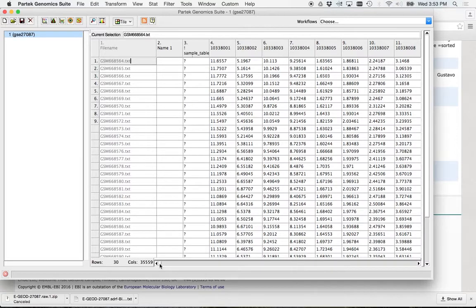You can see, as you get down here, we've got 30 samples, and we're probing approximately 36,000 genes. Is everybody with me so far? This is simple, isn't it? Everybody's looking at me like it's going to get harder. No, it's not going to get hard. It's pretty easy.